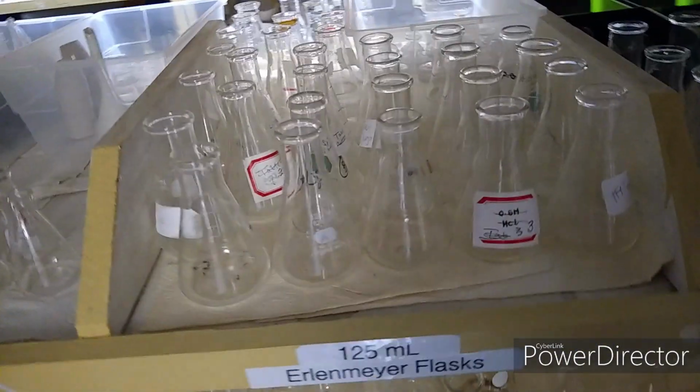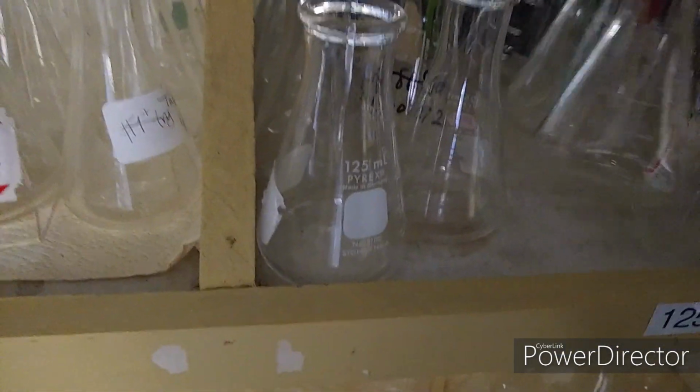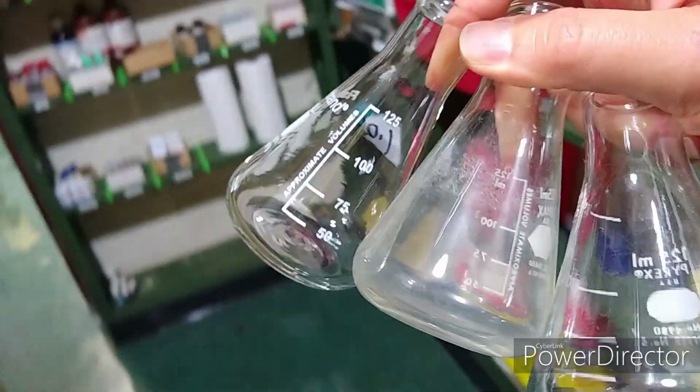And here are the flasks. For this lab, I like to use 125 milliliter flasks. Let's see if I can find some nice clean ones. Yeah, I don't know if those are clean. Ooh, that one looks pretty dirty in the middle. Maybe I'll get a different one. That'll give me at least 2 that look pretty clean. Alright.